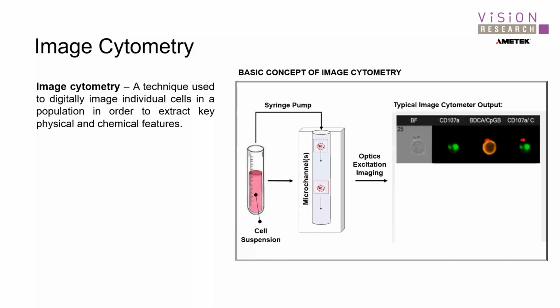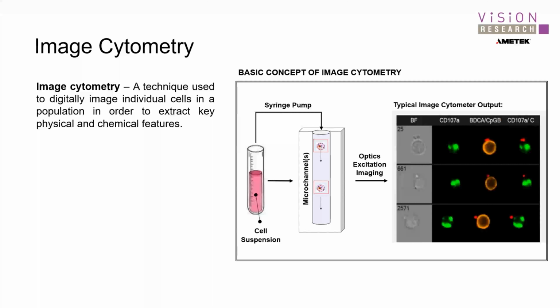What you get as an output in general for commercial cytometers capable of doing bright field and fluorescence is a beautiful bright field image together with a variety of different fluorescent channels of the individual cells. So each cell that flows in there, the camera takes an image of it, and you get this great library of cellular information. And what do people do with that?